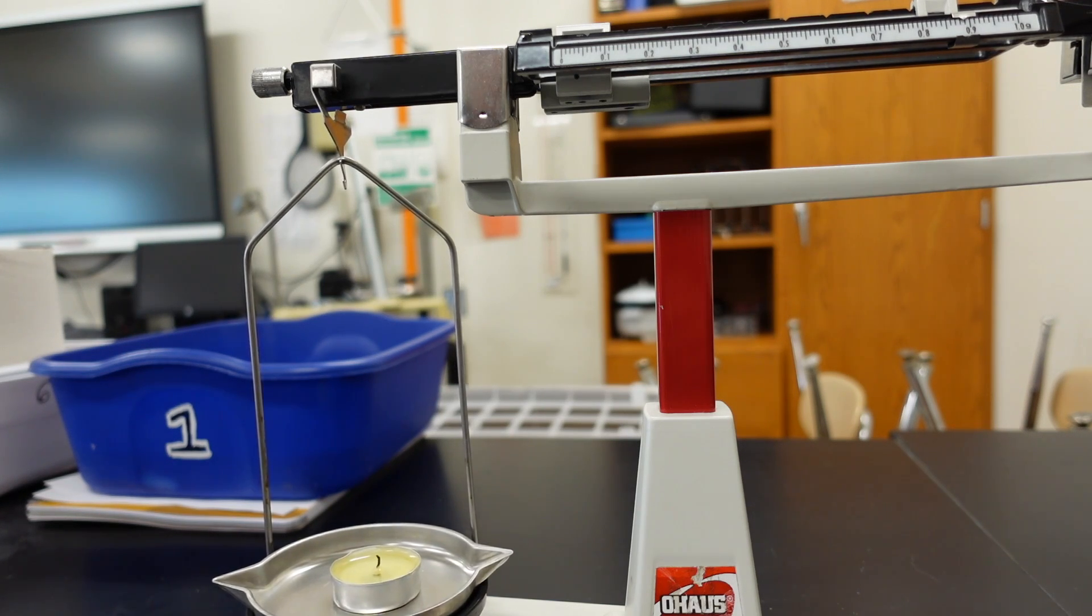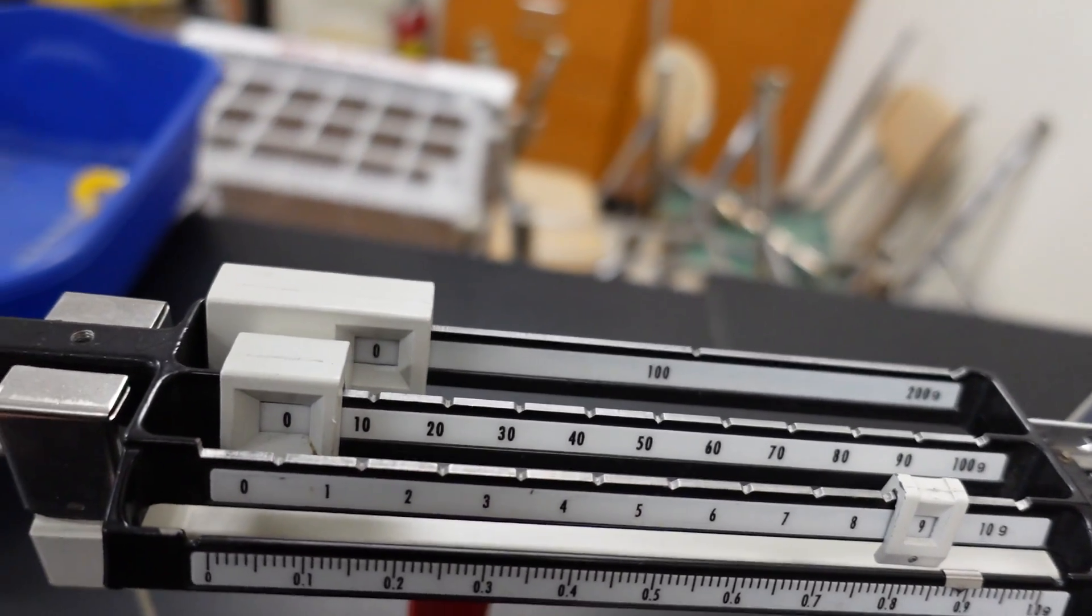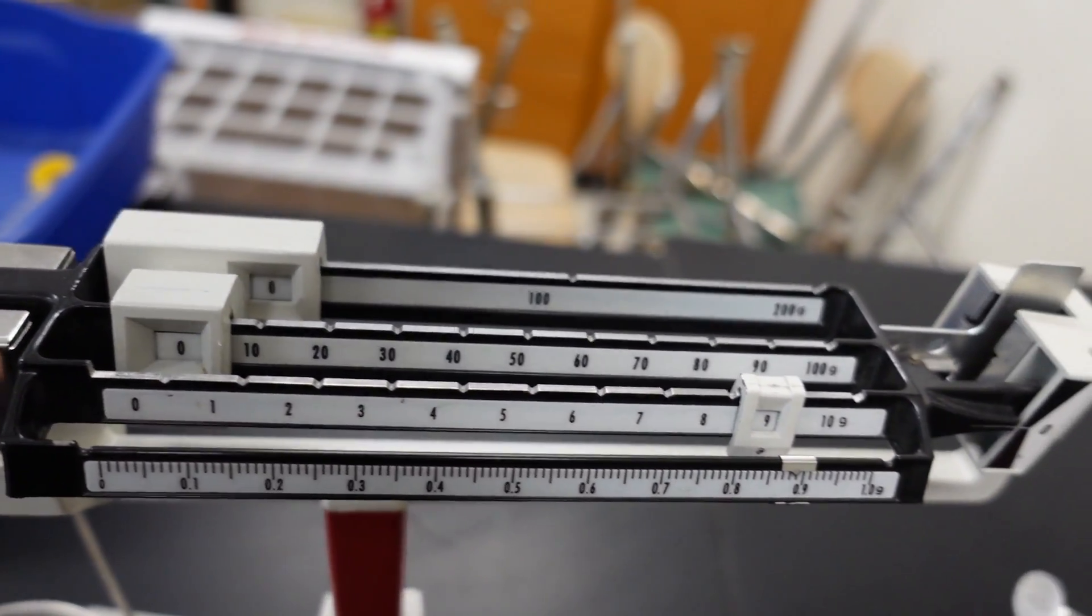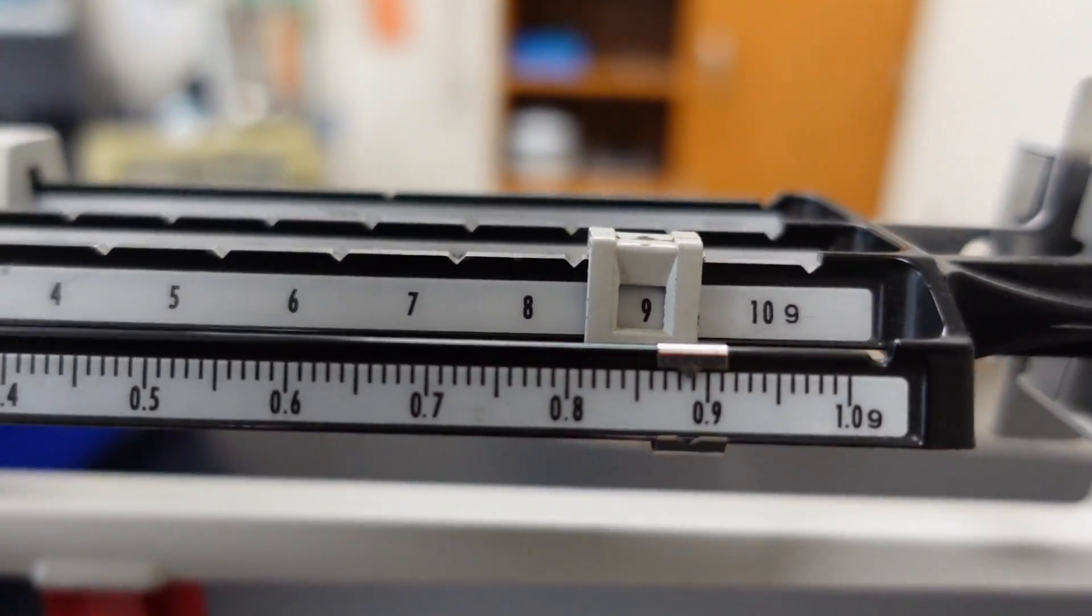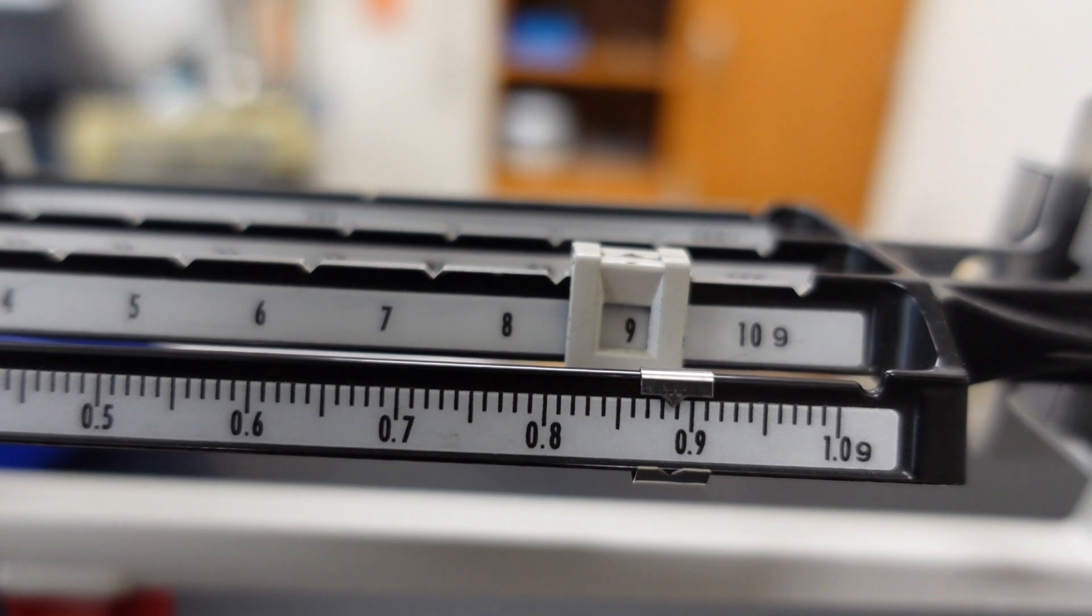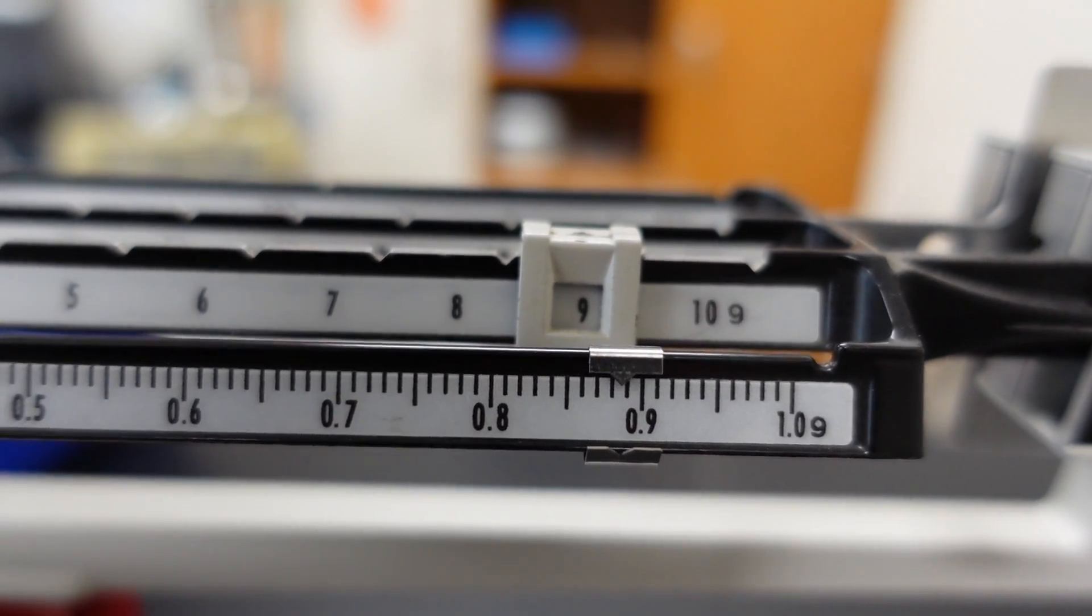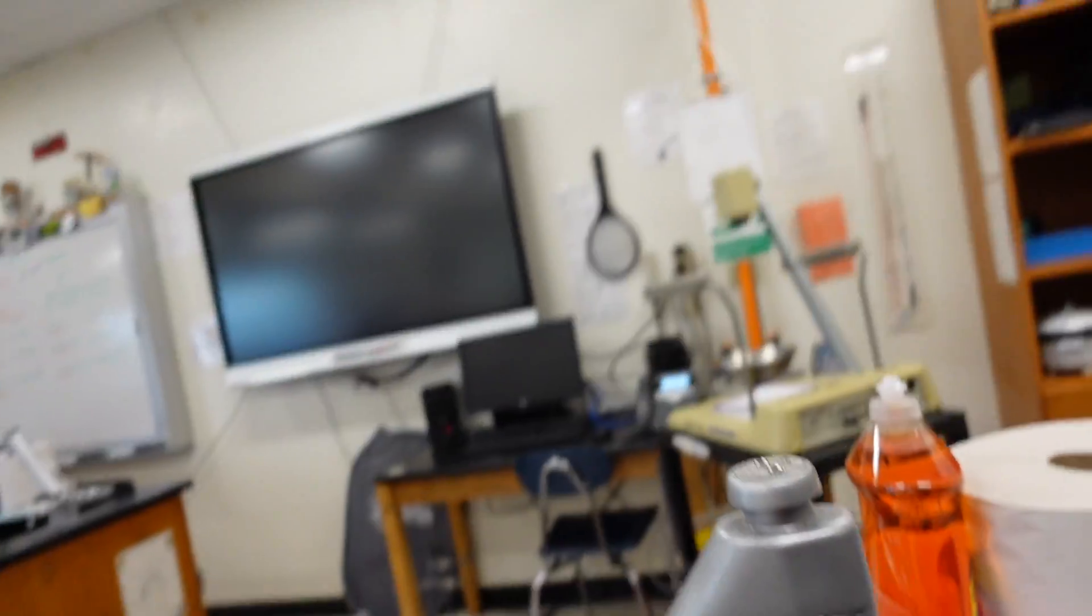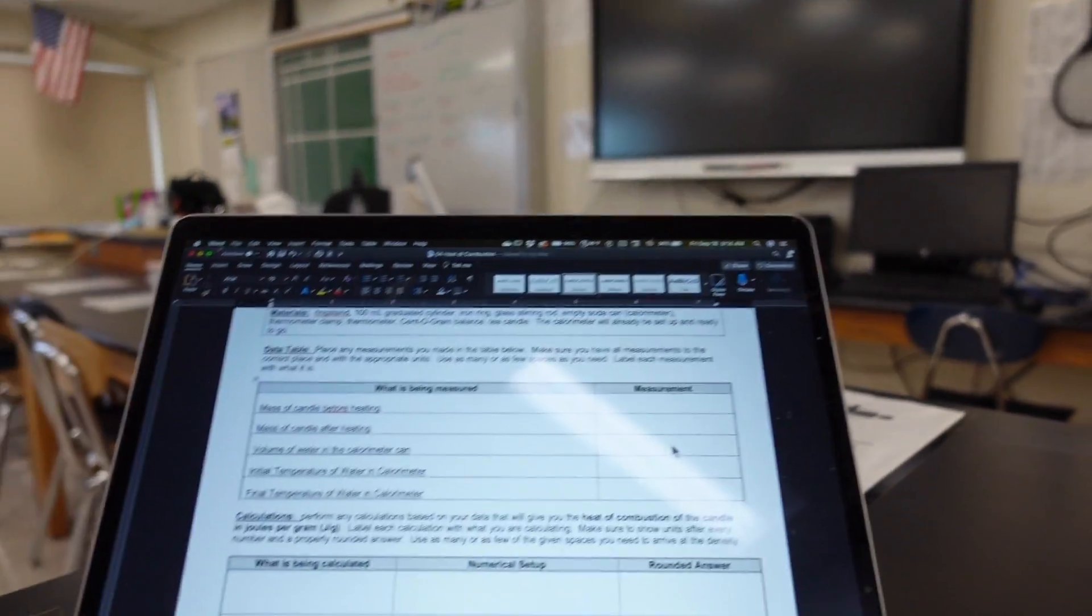Okay, let's record the mass of the candle after burning. And there you have it—all the data you will need to finish this lab. So what comes next in this lab? Let's show you.